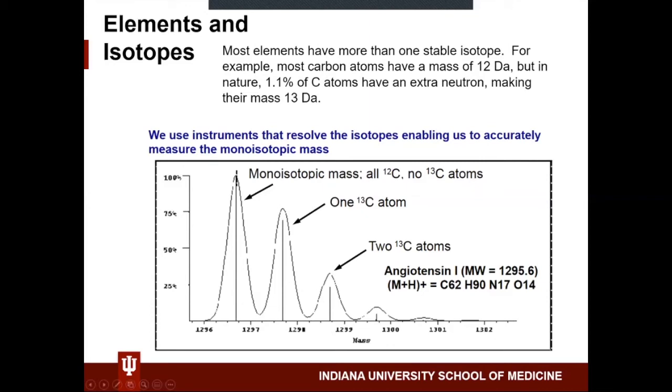So this becomes really a key thing when we're measuring biological molecules. A lot of the software made for the mass spectrometer, a lot of the additions in the last 5 to 10 years, have really been focused on how to isolate specifically the masses that have carbon-12. So you can think about why that might be important. Why would you only want carbon-12 and not carbon-13?